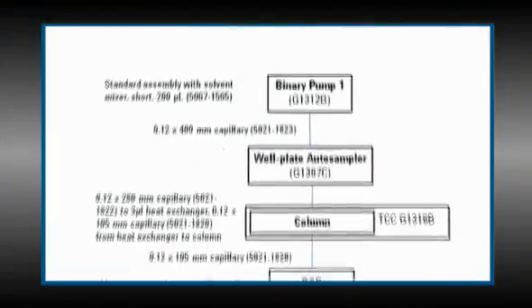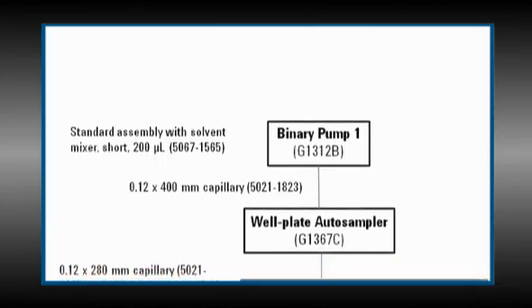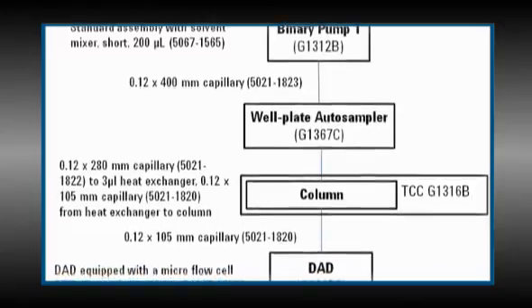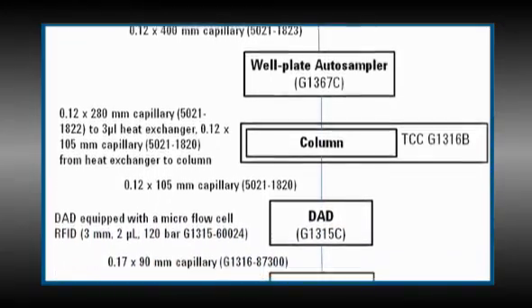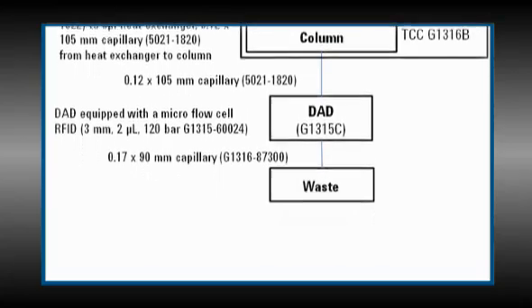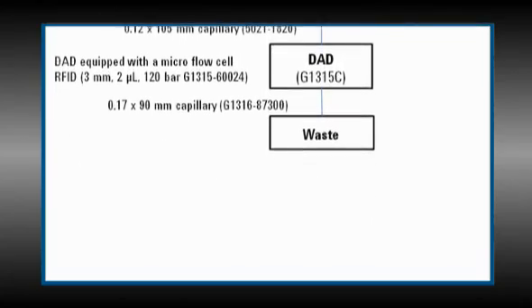It's a good idea to have a system map from when your system was working correctly or when it was first installed. Basically, you should sketch the setup and record where your connections are, how the electrical connections were made, your hydraulic or liquid connections, and even how your modules are stacked. Understanding what is normal is one of the key things you need to know in order to identify what is not normal. Having this system map will help you do this.